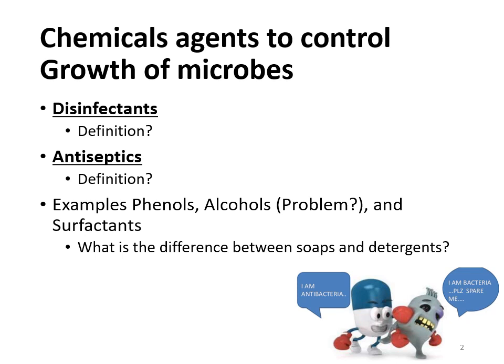The other term I want you to be familiar with is surfactants. Remember, surfactants means soaps and detergents, but there is a very big difference between the two. With soaps, you're just physically degerming. Degerming, again, means to physically remove, kind of wash away microbes. But what aren't you doing? You're not killing them unless it specifies that it will kill the microbes. Detergents, on the other hand, destroy the cell membrane of the microbes. So detergents actually do kill. They are very good antimicrobials.